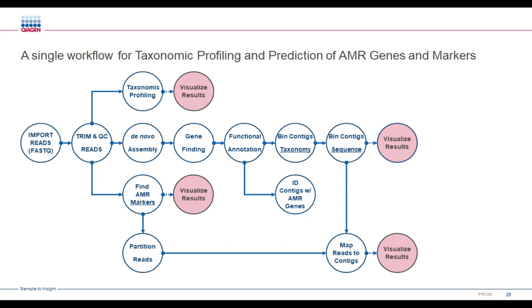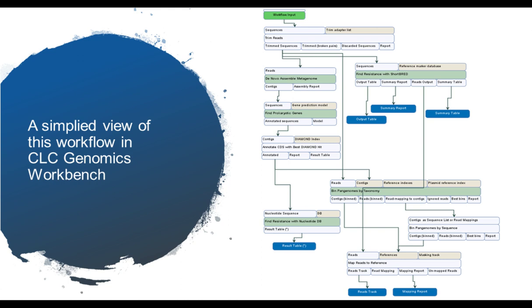And this view here, of course, is kind of a PowerPoint graphic figure of what this work looks like. But within CLC, this is a simplified view of what a workflow might look like. And it's very easy to build. These workflows take just about a few minutes to assemble.